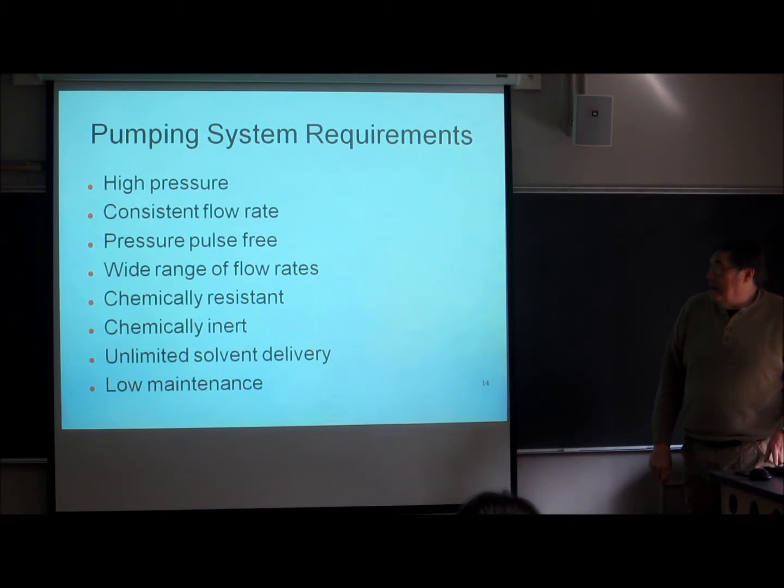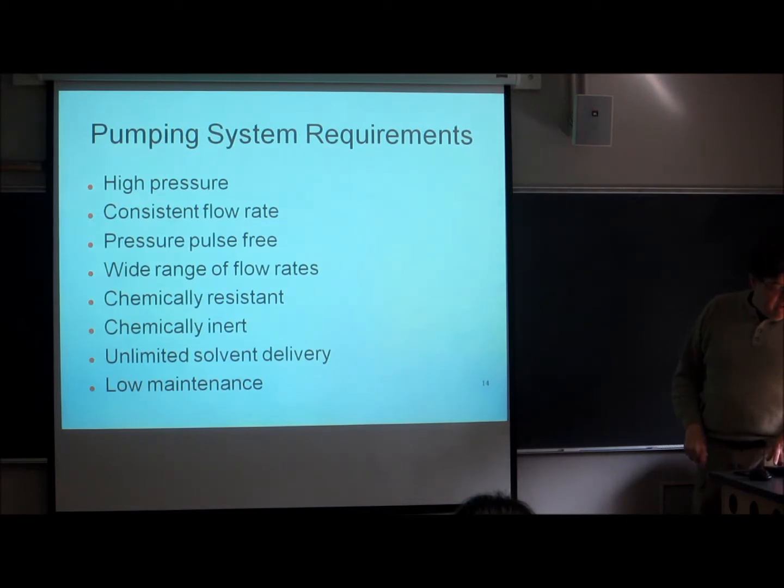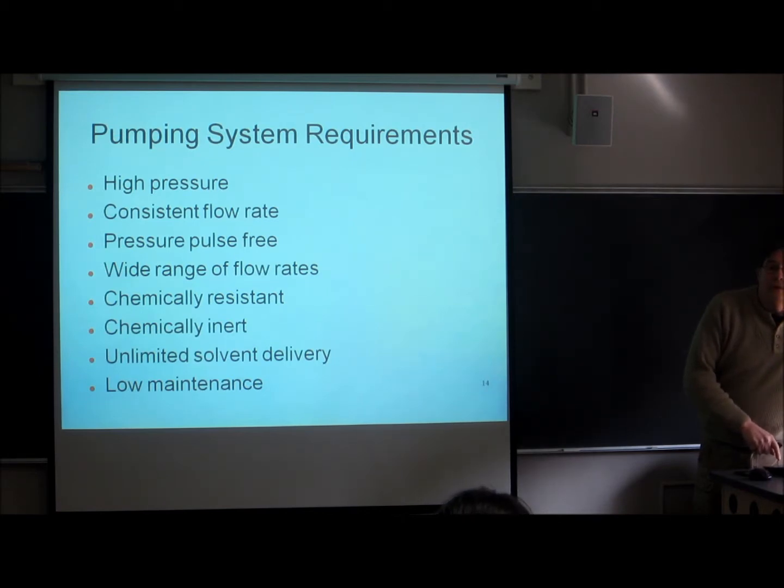So the pumps used for the preparative are a quite different variety than the ones we use for the analytical. We're going to focus on the analytical. They need to be chemically resistant. We don't want them dissolving in the solvent, right? And they have to be resistant to abrasion, to scratching, unless we're very careful getting particles out of the solvent stream. They also should be low maintenance.